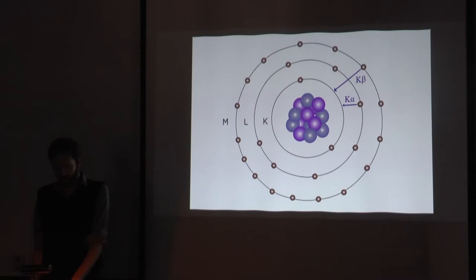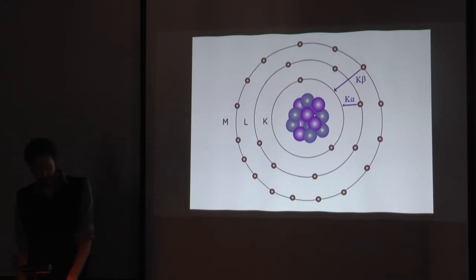In theory, the energies of every photon in this process is unique to each element in our sample. The frequency of a particular energy signature will therefore tell us the density of each element. Of course, nothing in nature is ever uniform, and there are thousands of variables that might throw this process out of whack. But in theory, this is supposed to be how it works.